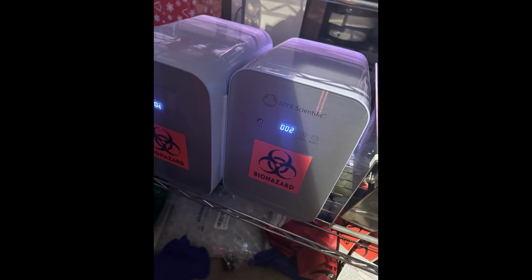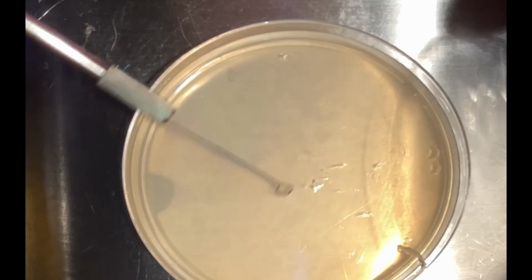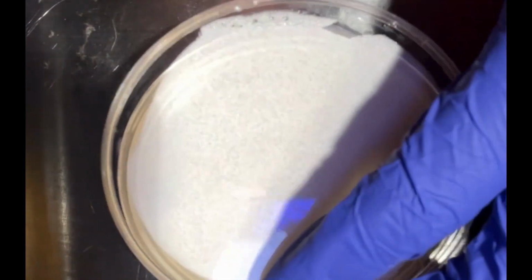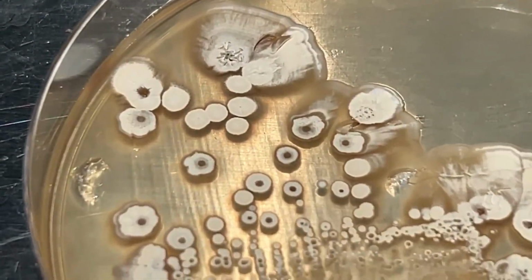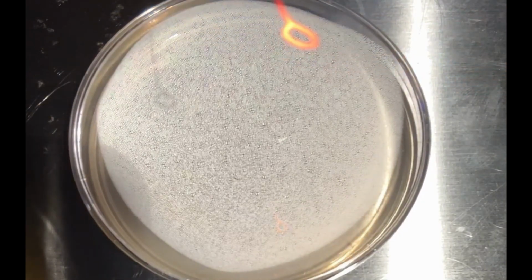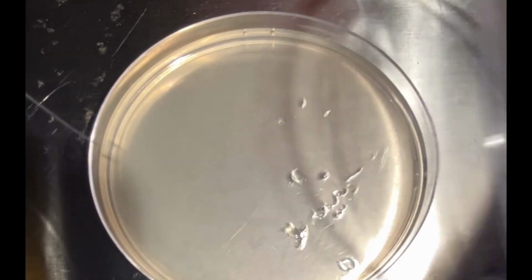I set my incubators to 30 degrees Celsius, which is the incubation temp of Streptomyces, and pre-warmed my agar plates to incubation temperature. I now needed to spread the concentrated Streptomyces bacteria I bought over all of the agar plates. Because of their solid nature, the bacteria would stay in place when spread over the agar, and if spread thin enough, one bacteria could multiply itself far away from the rest, forming a visible sphere of just itself called an isolated colony. But due to the bacteria's concentrated nature, I would have to sterilize the spreading utensil after every spread and dig into where I've already spread just a little to start the streak again, to effectively lower the concentration of bacteria to get me separated colonies.